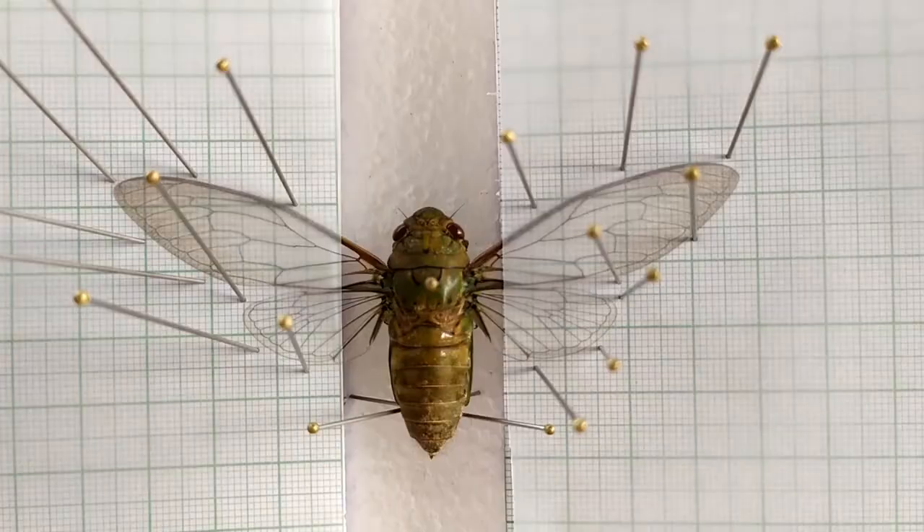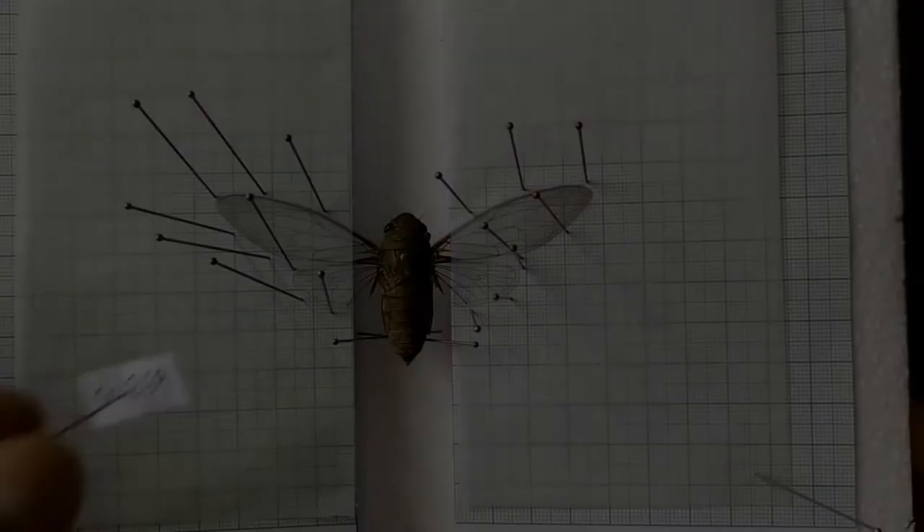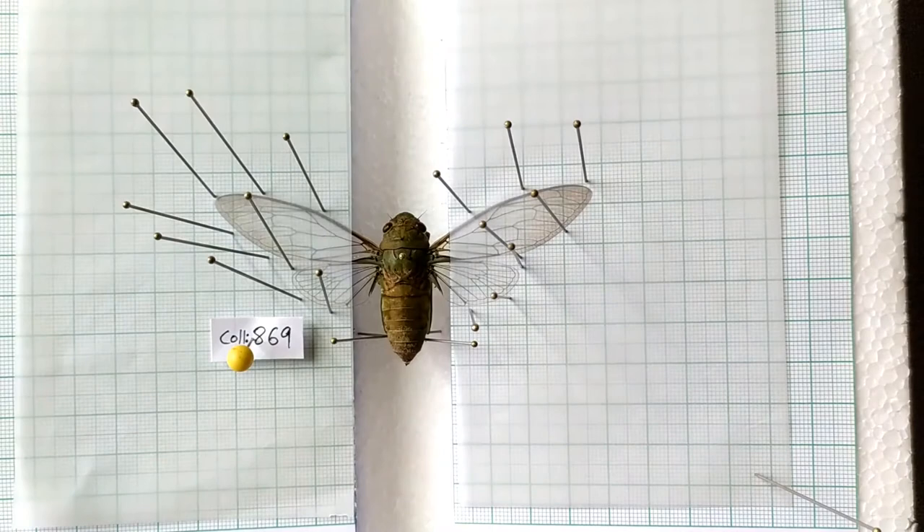The cicada is now pinned and spread. Using a pin, fix a small piece of paper containing the specimen number or collection number. Leave the board in a warm, dry, and secure place away from insects and pests for a week or two to dry.